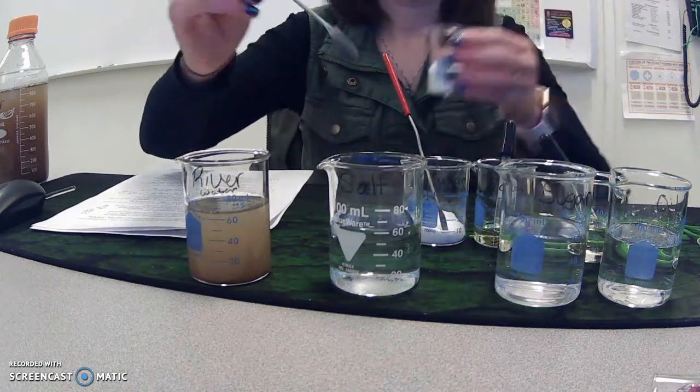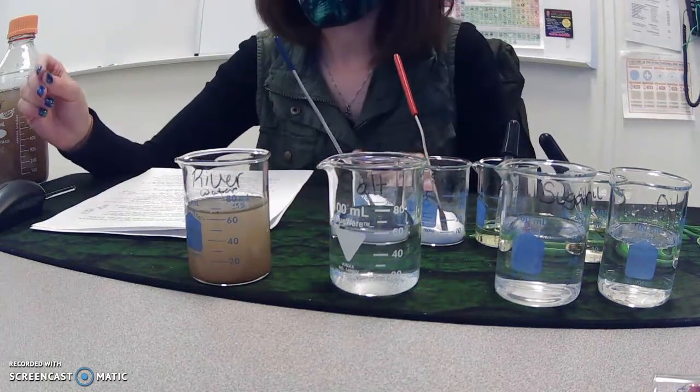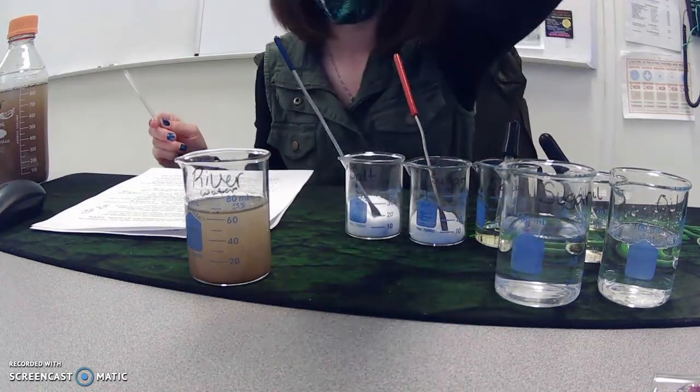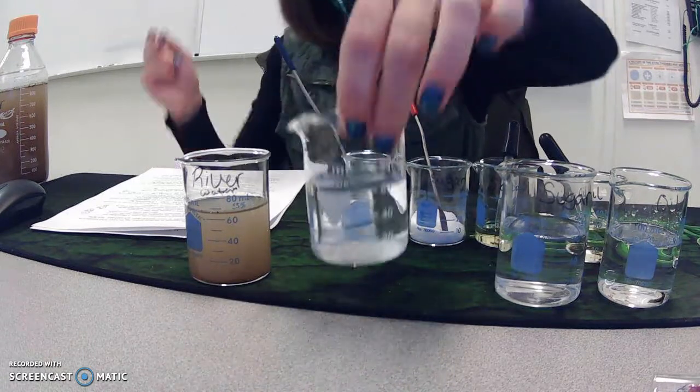You can see some at the bottom right now. And then we're going to stir it with our glass stirring rod. So here it is unstirred, kind of a little translucent. It's gone away some already.